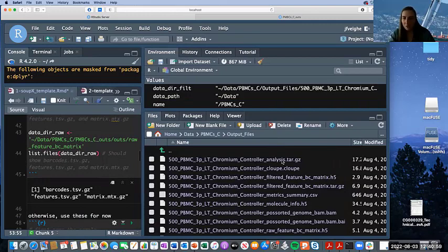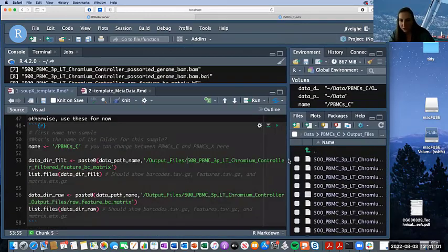Give me one moment, I'm going to type that out for you. Maybe we just specify the folder. Oh no, I see. I'll have you copy from my Scratch directory, and I'll write the code for that to make sure it gets to you from the right spot.